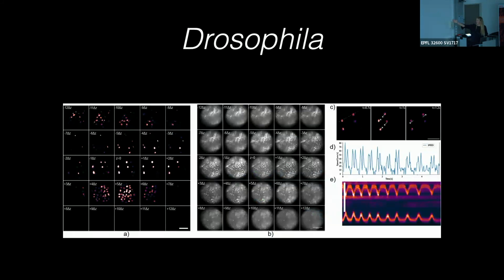And here is one of those times where we really want to stress that, sure, if you do something like SCAPE or some kind of light sheet, that can be really fast too, right? It can be probably almost as fast as this, but it also has the amazing advantage of selective illumination. This is wide field illumination. You're illuminating everything at the same time and you're imaging everything at the same time. So all the out of focus photons are lost. But you can do bright field with this. And I think that's powerful. And I think we should do a lot of correlated imaging with bright field and fluorescence.